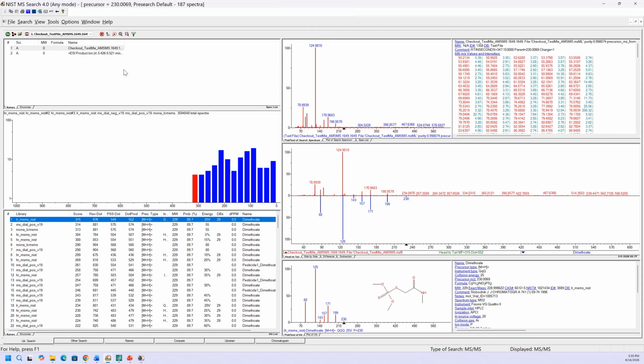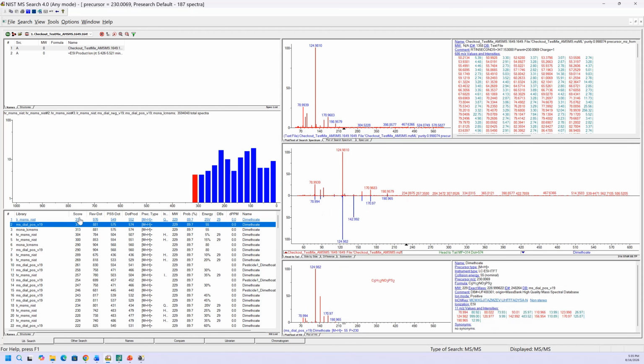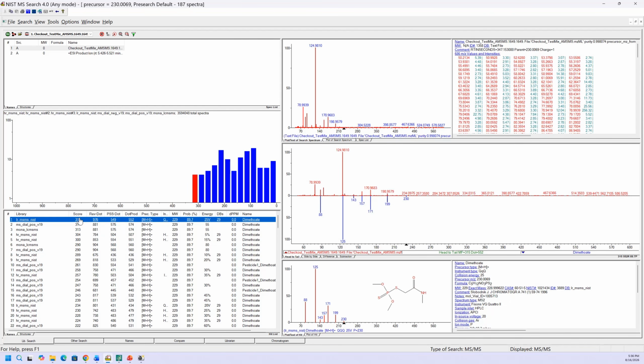So that's pretty much the settings there and how you use it. Of course, this is the unknown on top, a butterfly display here, and the best structure, whichever one's the spectrum of the library, which is shown here, which again, I said I stepped through with the arrow keys. So that's pretty much how you use the public libraries. I hope you might find them useful in your work. So give them a try.